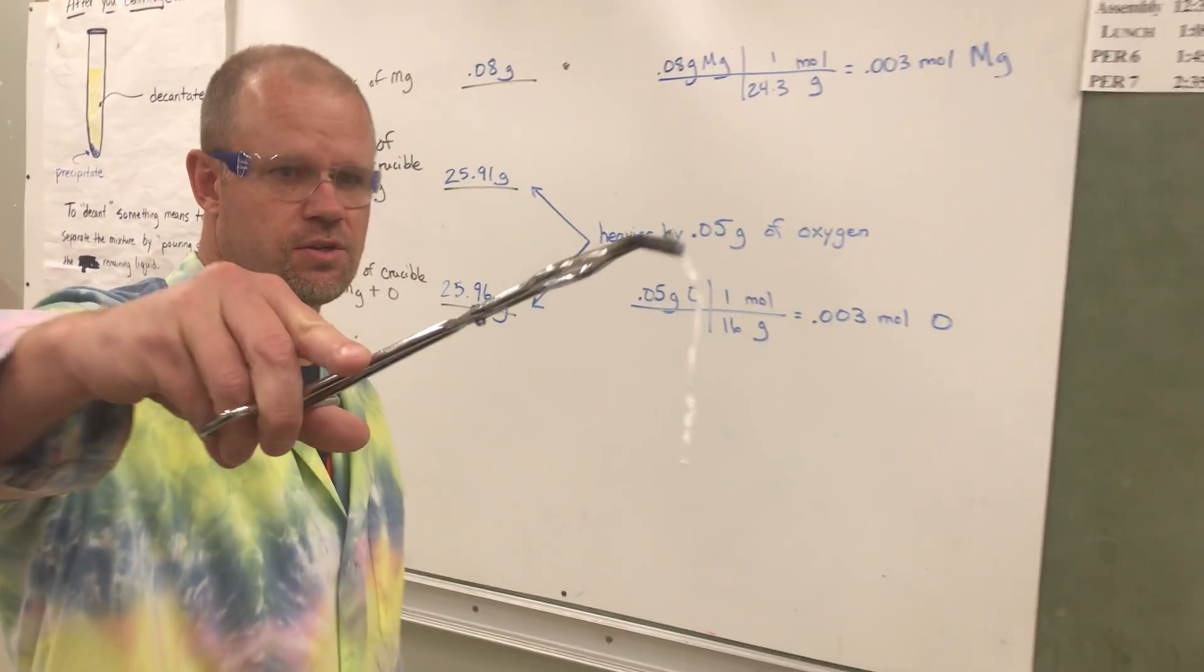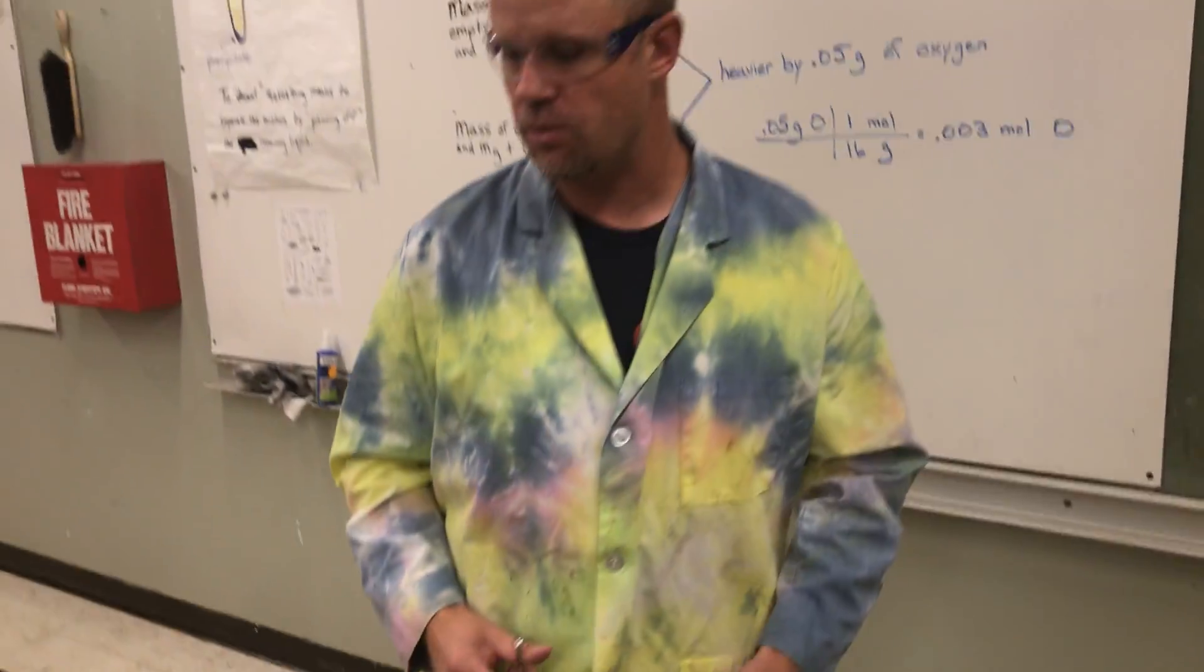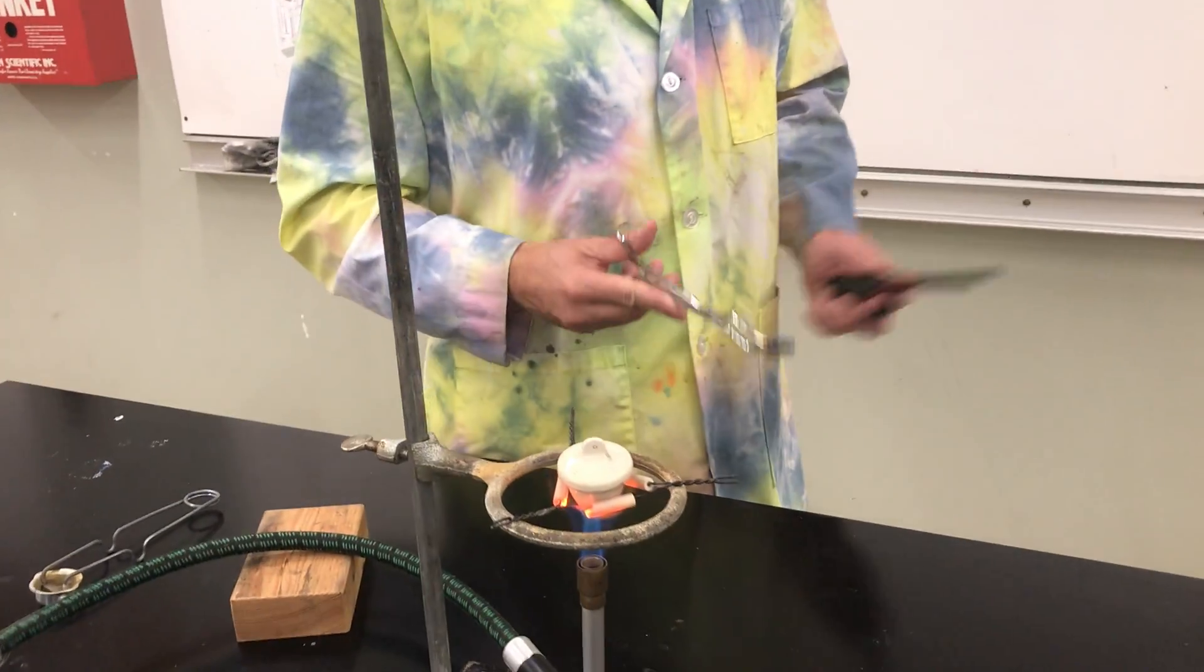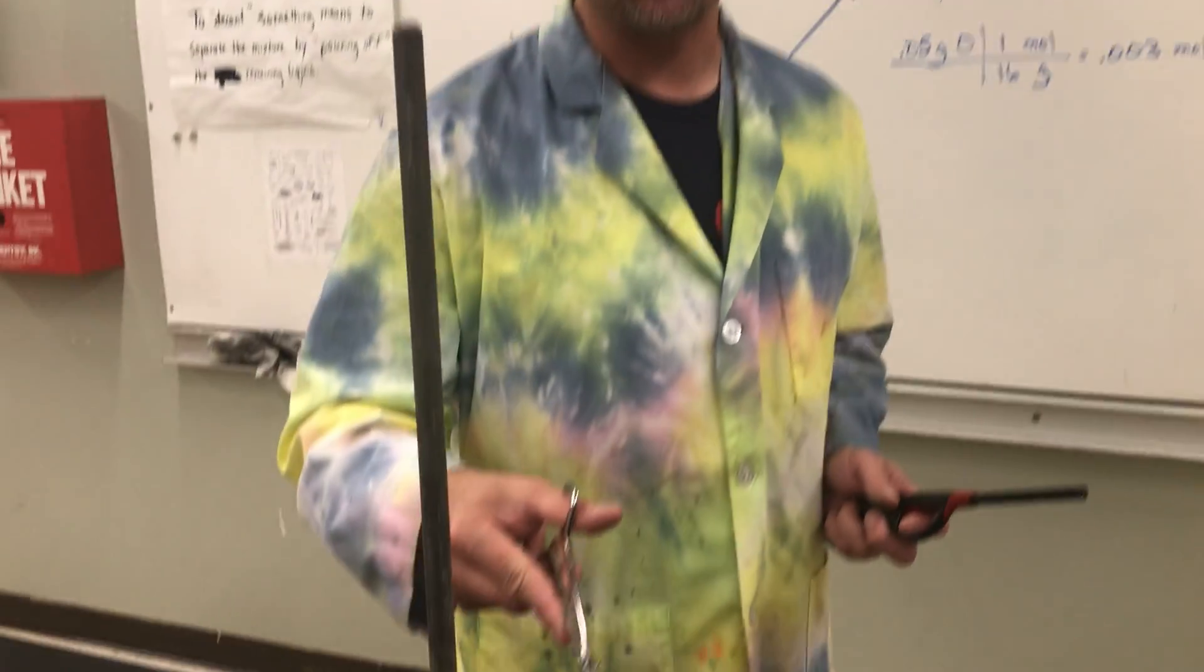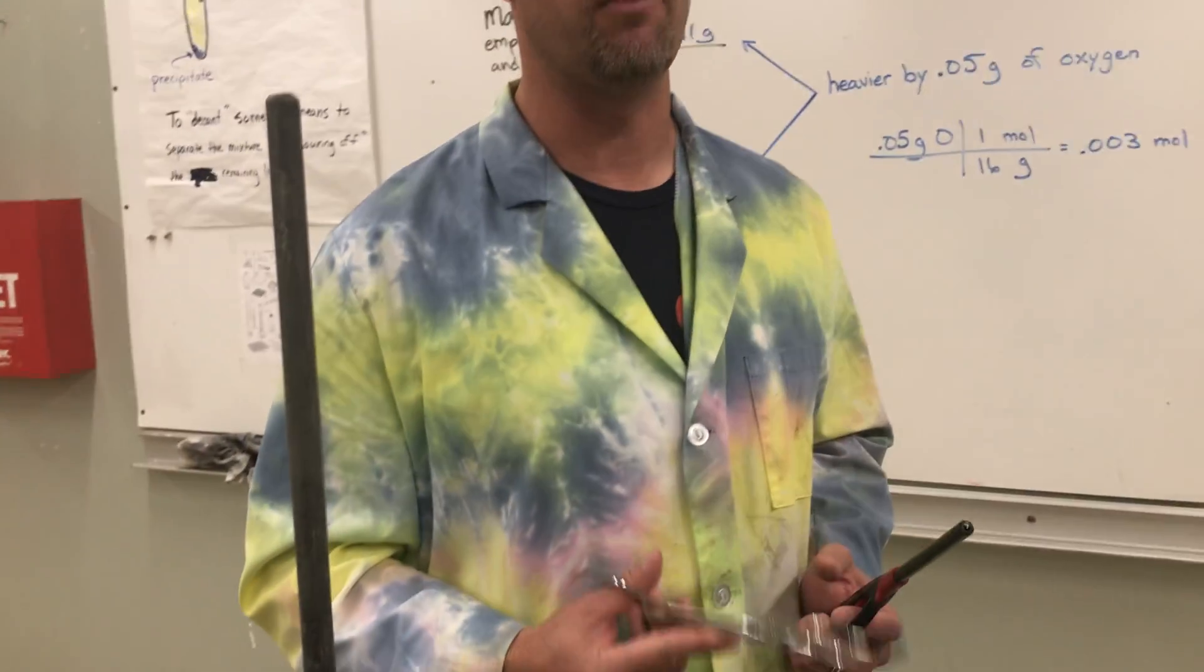And as you look at that, we'll turn the lights on. This looks like just a big old string of ash. And then it just went on the table. Now a lot of that ash actually floated away as smoke. So the reason we're doing that reaction inside this crucible with a lid on it is we're trying to get it to actually react and give off this smoke, but we catch the smoke. We capture the smoke inside there and it settles into this dust because we would like to know how much it weighs.